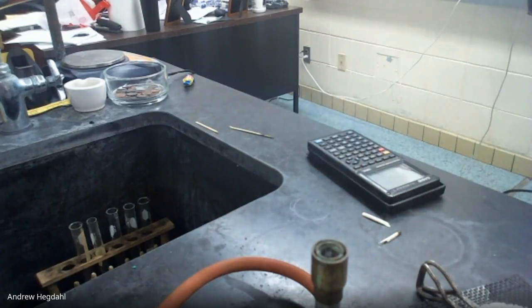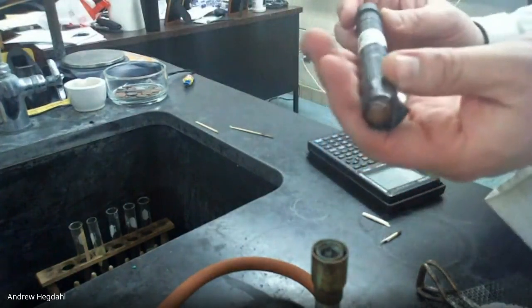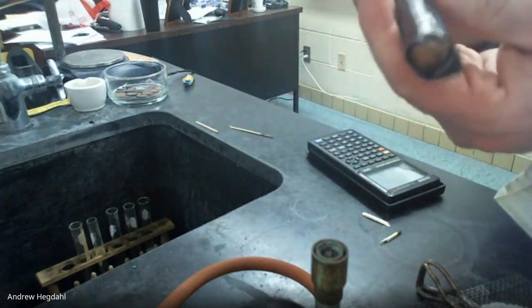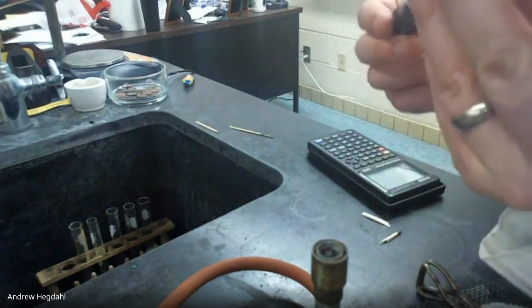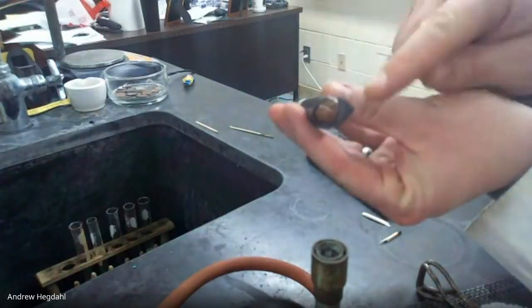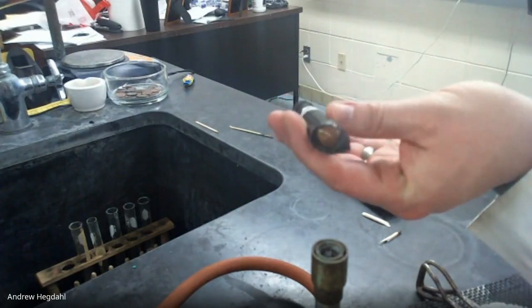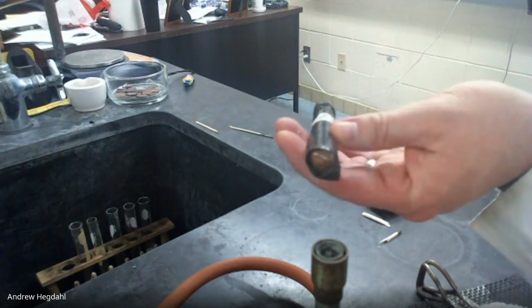Letter E, I have to go grab one from a lab station. Did you guys do E already? No, okay. Look at the bottom. You could describe it as like a brown sugar or rusty brown. So letter E is wrapped in electrical tape because that salt decomposes in sunlight. To protect it from breaking down, we wrap it in electrical tape. Okay, so this is letter E, and it has kind of a reddish brown color to its crystals. If you want to stay in kitchen descriptions, you could say like brown sugar.